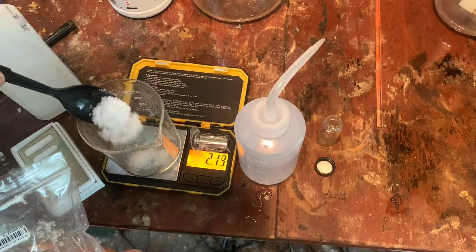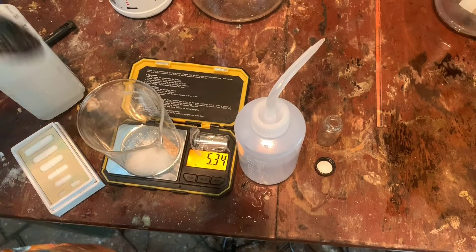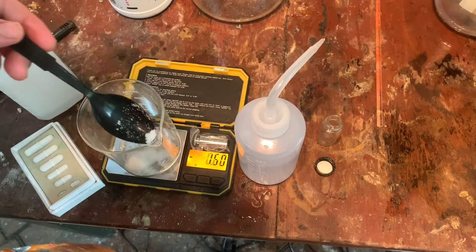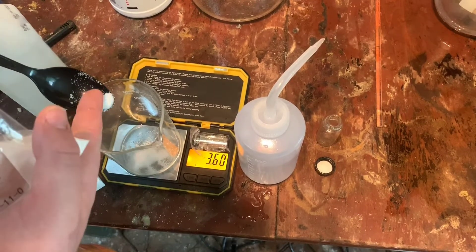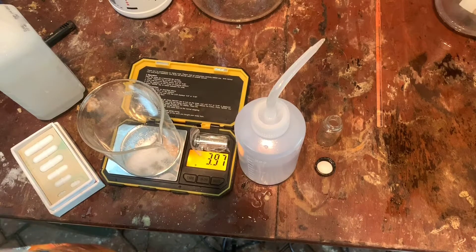I'm going to get four grams of potassium iodide. There we go. That's close enough.